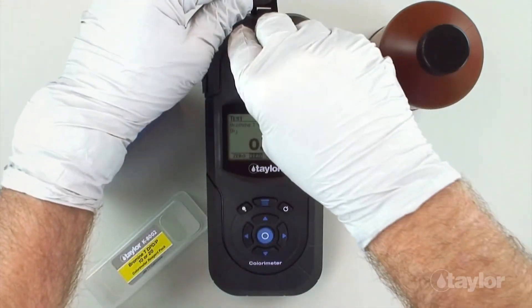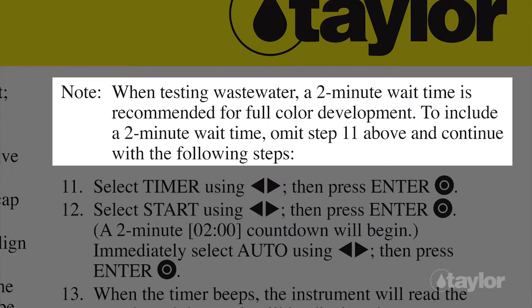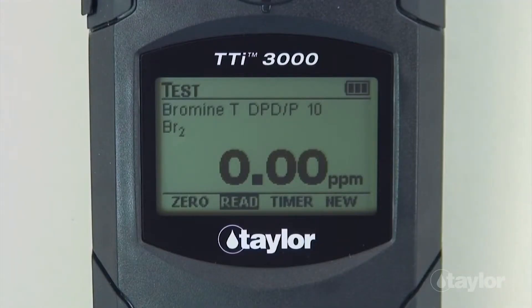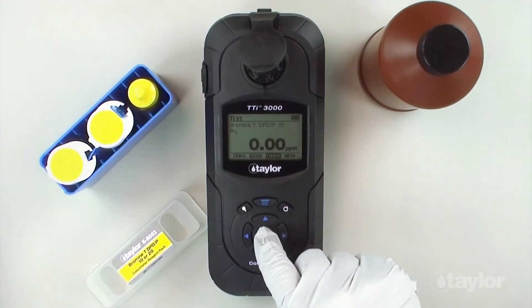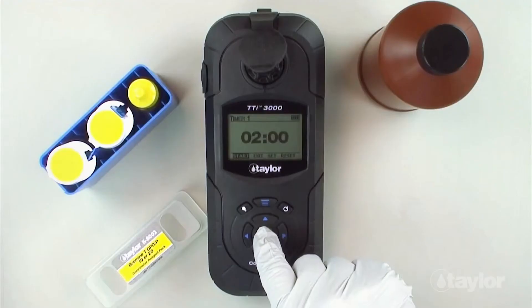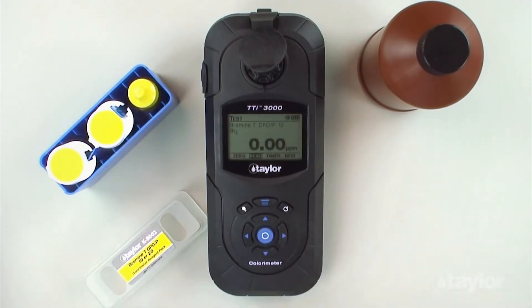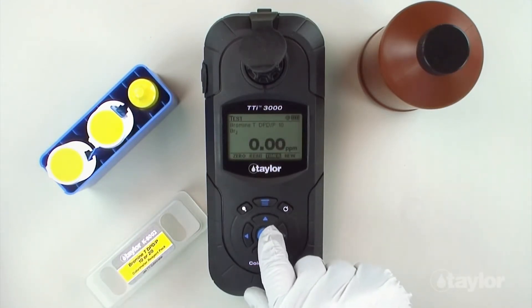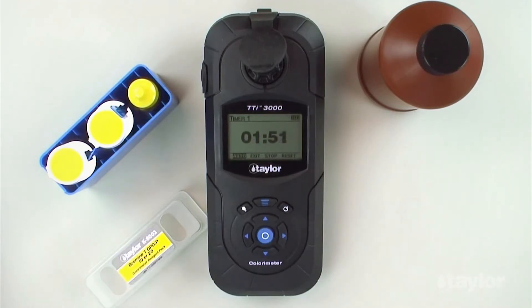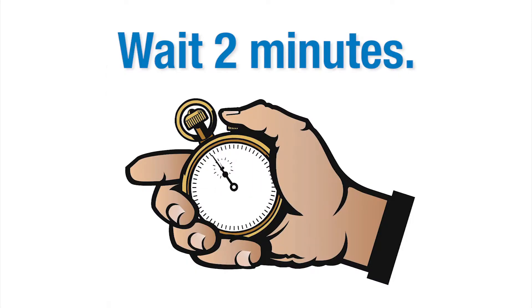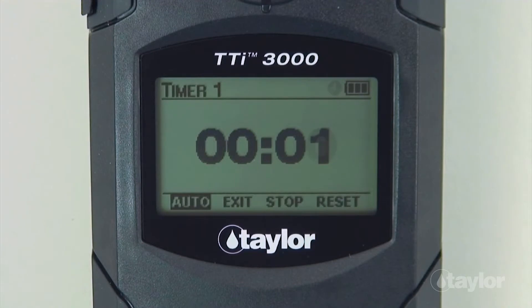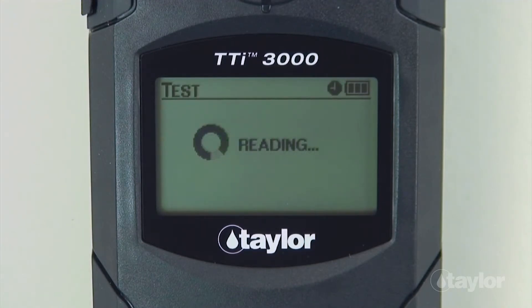Insert the sample cell into the sample cell compartment. Since we are testing wastewater in this demonstration, a two-minute wait time is recommended to allow for full color development. To begin the process, select timer using the scroll arrows and then press enter. Select start, then press enter. The two-minute countdown will begin. Immediately select auto and then press enter. When the timer beeps, the instrument will read the sample and the result will be displayed.